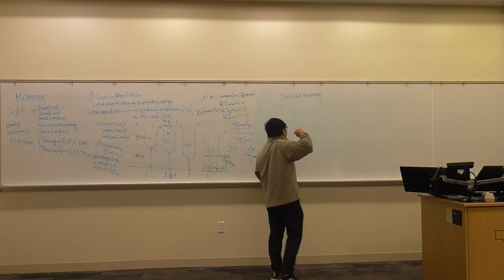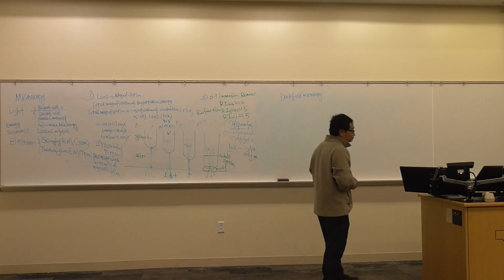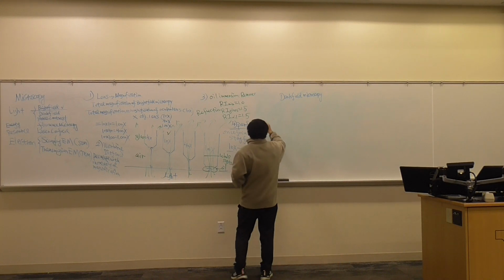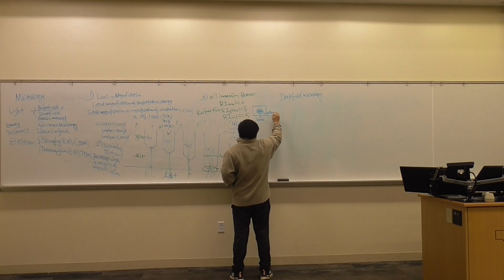So what is bright field microscope, first of all? Bright field microscopy. The specimen is usually dark. Background is bright.